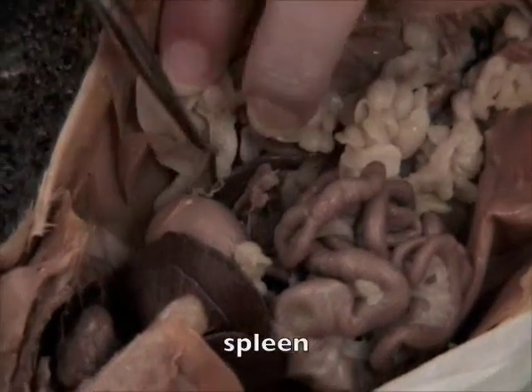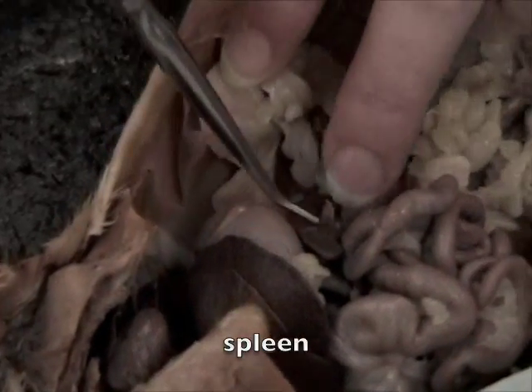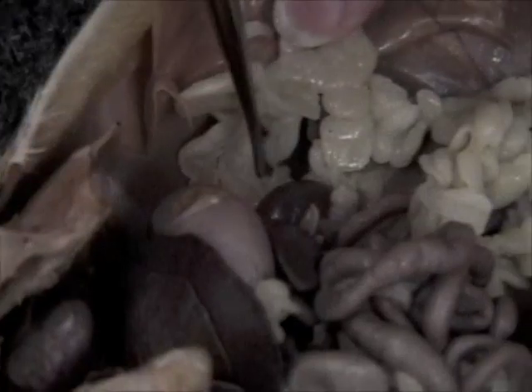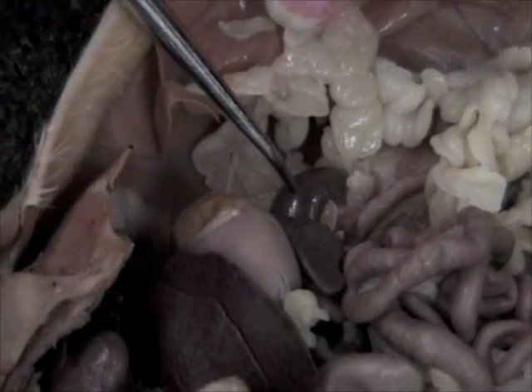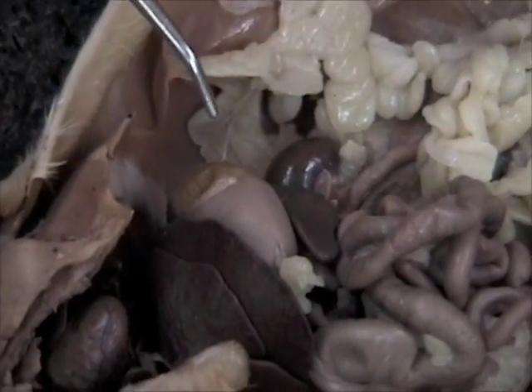Is this flap right here? The spleen. The kidney is right there. In these guys, the kidney is actually the typical kidney bean shape. The kidney bean actually got its name from the shape of the mammalian kidney, and also from the color and consistency of the mammalian kidney.